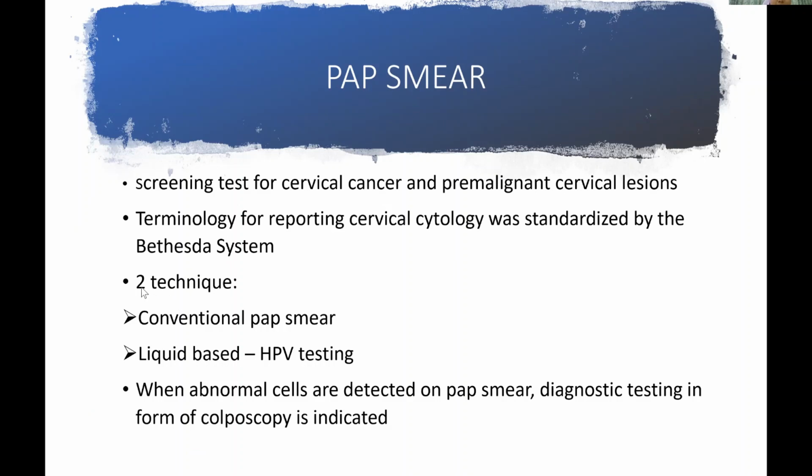Basically, in PAP smear we have two techniques, conventional and liquid based. Conventional means the PAP smear is smeared by the staff in the OBGYN clinic: after the doctor takes the sample, the staff smear it immediately.